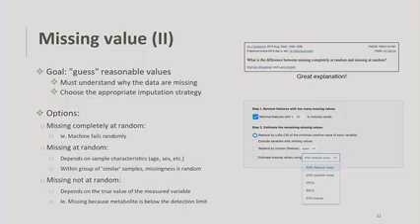The younger you are, the more likely you are to have missing values because you go to the doctor for fewer checkups compared to when you're older. And so in this case, the idea is if you're able to get all samples that are the same, all people that are the same age, for example, then the data would be missing completely at random, but it depends on that. So again, this is not usually something we see with metabolomics data, but there are a whole set of methods that deal with this.